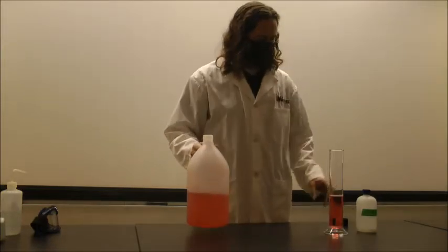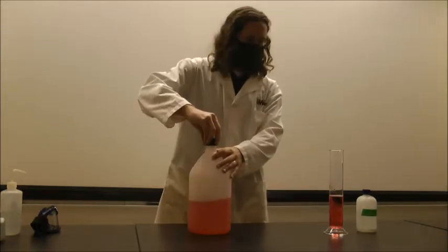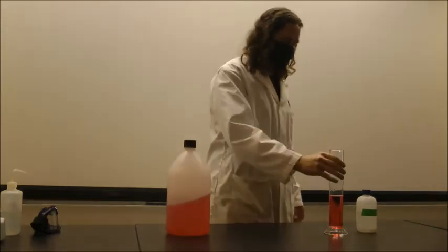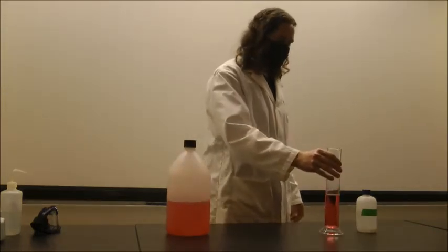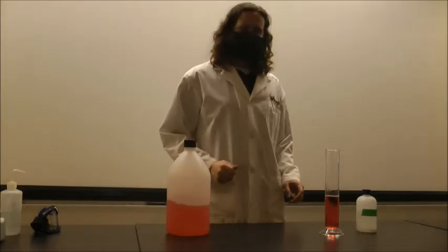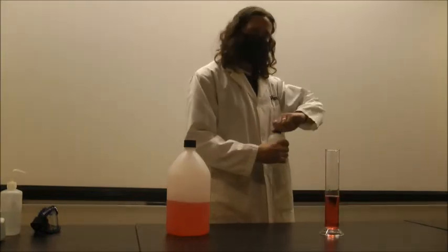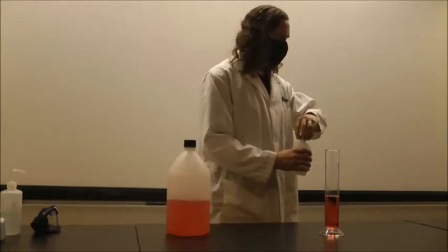What we're going to do is play with our pH by having this red liquid, that's already acidic, and then we're going to add some base to it, but we're not going to completely mix it up. And let's see if we can get a pretty cool result.